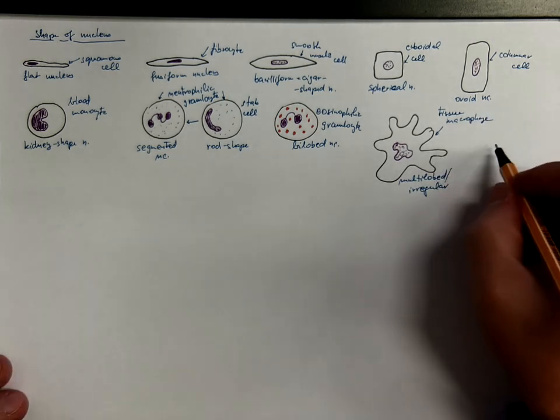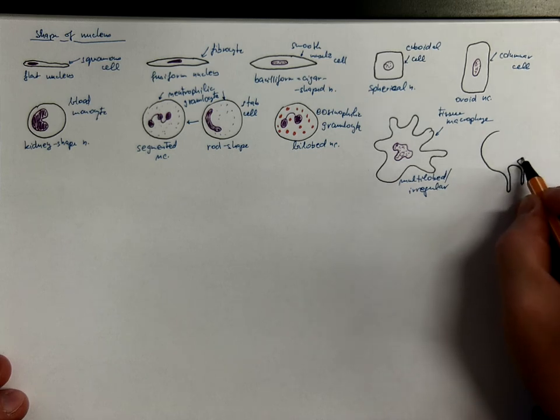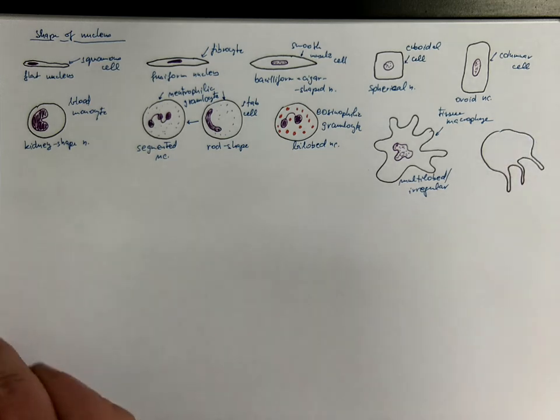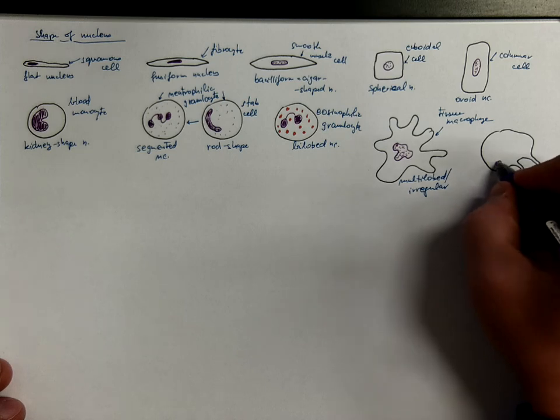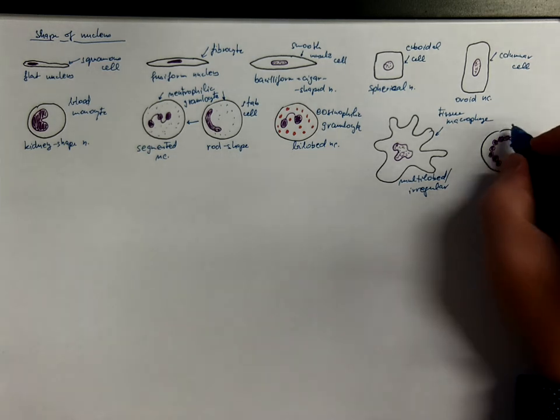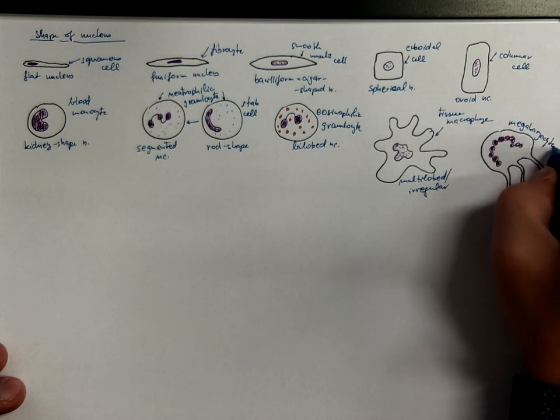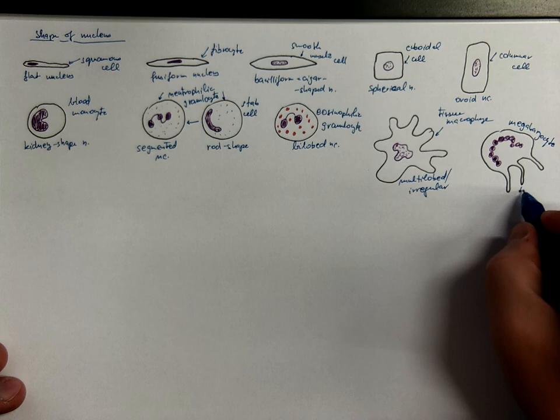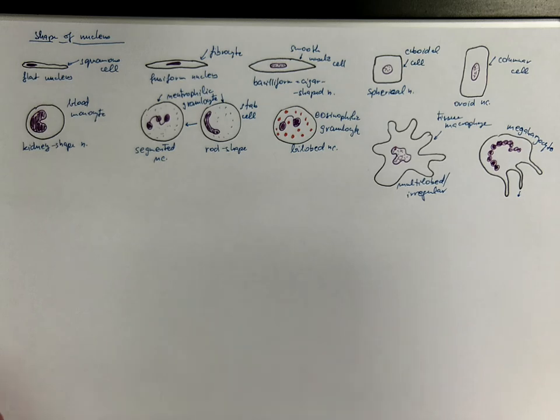Or in megakaryocyte, which is a multinucleated giant or really large cell with many nuclei, but they frequently occur in chains, so it appears as more nuclear segments in a megakaryocyte, which is the mother cell of thrombocytes. But in this case, it's more nuclei, okay, in a chain.